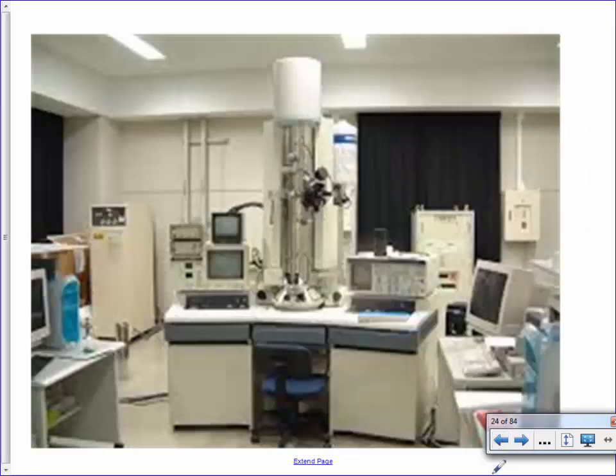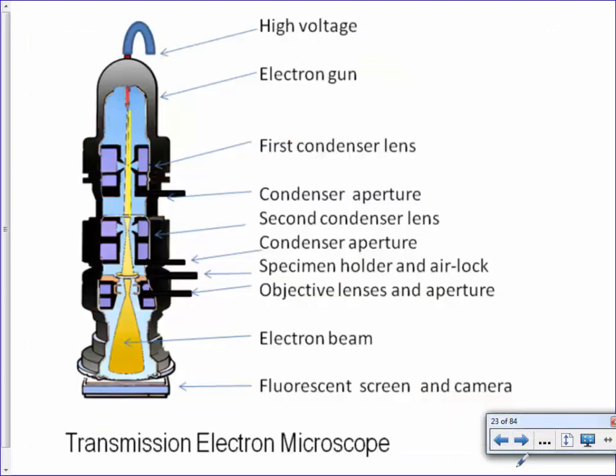So, I found a picture online. We're not talking a high school lab. High school labs don't have one of these, right? These are millions of dollars. This is not like a desk microscope. This is a huge instrument that fires electrons at things. So, here's a picture that I found that tries to describe what happens, but basically you've got a gun and it shoots electrons. And depending on how those electrons pass through different things depends on the picture you get.